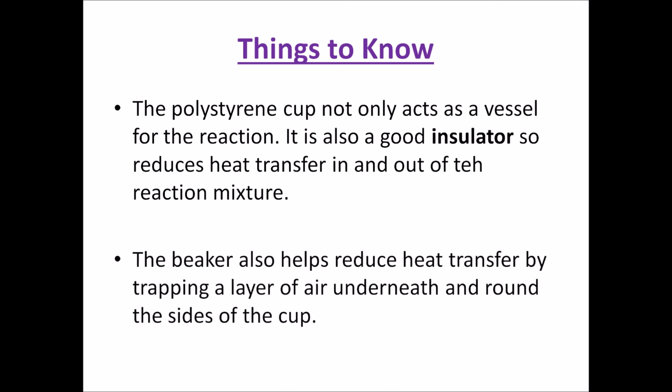The beaker also helps reduce heat transfer because it's going to trap a layer of air underneath and around the sides of the cup, and as we know, air is not a very good conductor of heat, so it's going to reduce the loss of heat by conduction. It's also going to prevent heat loss by convection because the polystyrene cup will hopefully create a seal around the top of the beaker and stop the air escaping, so that air is going to get trapped inside and will prevent the loss of heat.